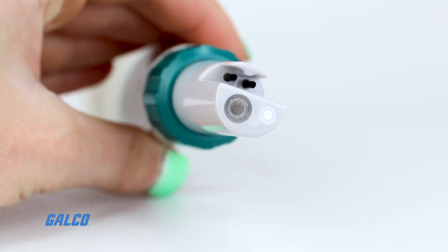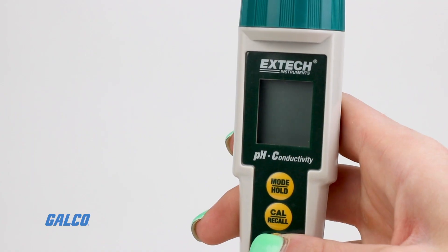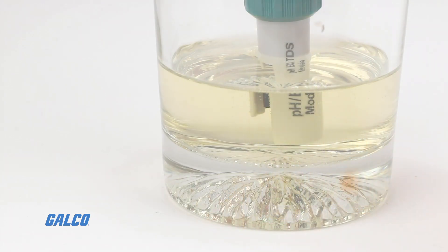The EC500's combination electrode is able to measure conductivity, TDS, salinity, pH, and temperature.